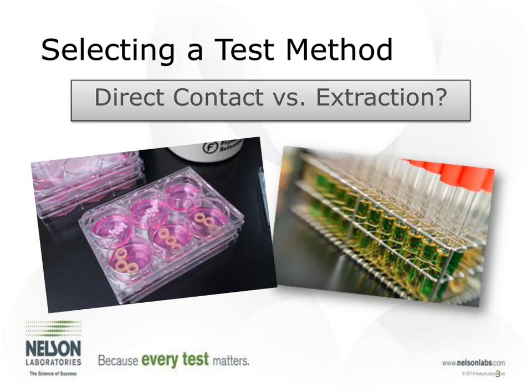With the testing that we're going to be talking about going forward, we're going to be talking mostly about extraction versions, and that's because the new tests that we'll be discussing, or the complications around those tests, revolve around extracts. And then also those are the most common tests performed.